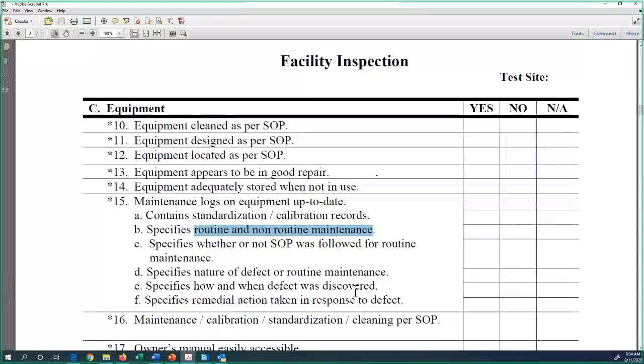Then people will say, oh, you did this. How about the sample I took before? The area count is 1,000, and after that it is 2,000. That's normal. But if you don't have the record to show that, there's a big question. Why yesterday is your peak 1,000, same concentration, and today it is 2,000? You need to explain why, otherwise it's not consistent. So yes, routine and non-routine is a must there.